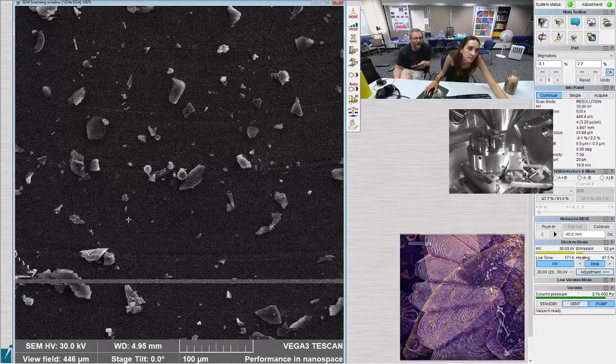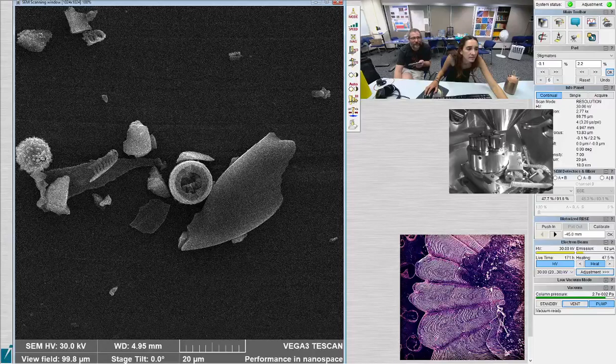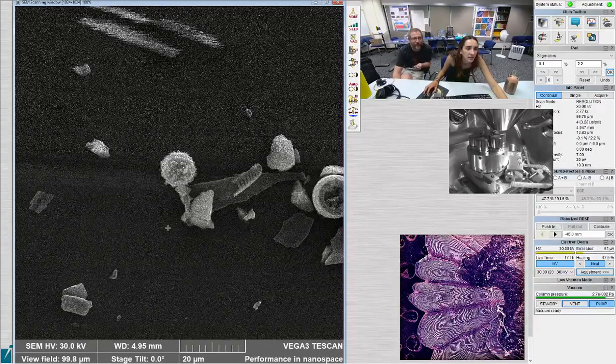Is that a chrysophyte? I think so. Like a chrysophyte with fins all over it, or is it just one of those little blocky, chunky things we've been looking at? I think so.